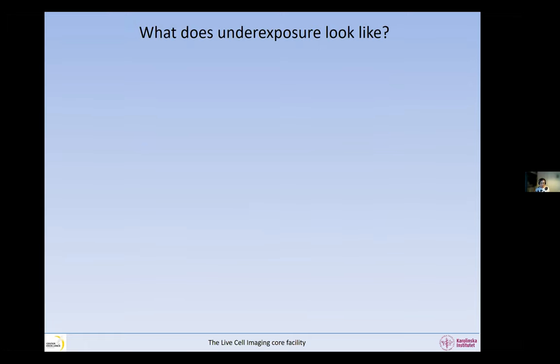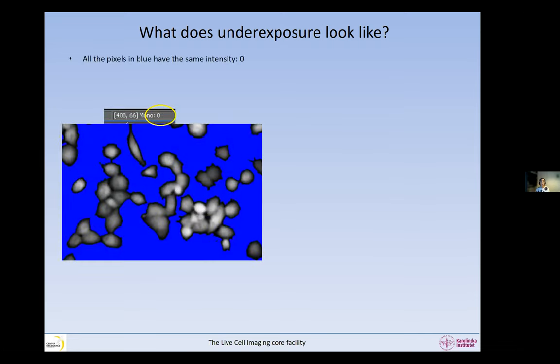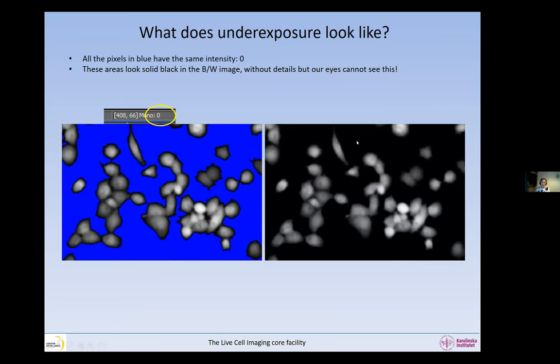One problem is saturation; another is underexposure. We've seen what saturation looks like — a flat top if we draw a line. What about underexposure? These pixels are color-coded in blue. All the pixels in blue have the same intensity of zero. Underexposure is much harder to detect than saturation. When you don't have this blue color coding, it's very difficult to know that you are actually underexposed. Our eyes cannot really detect this — you need the help of this mask.